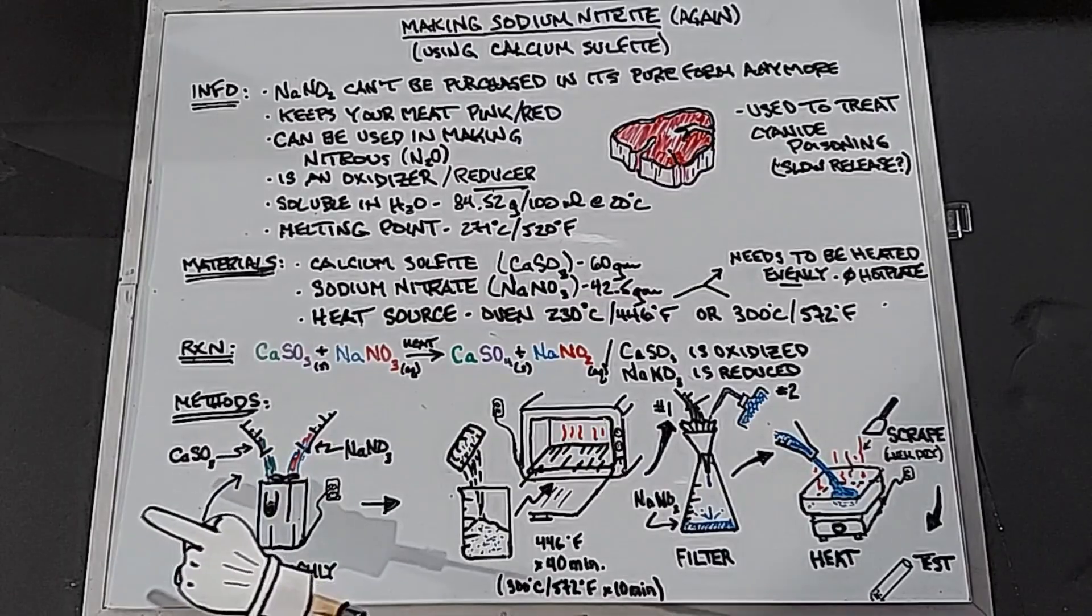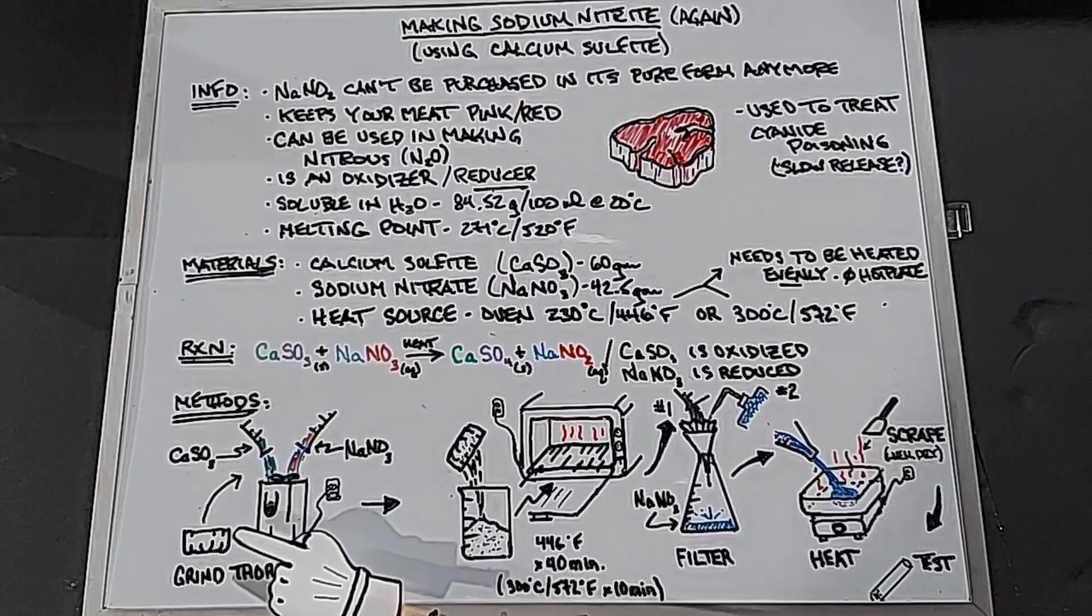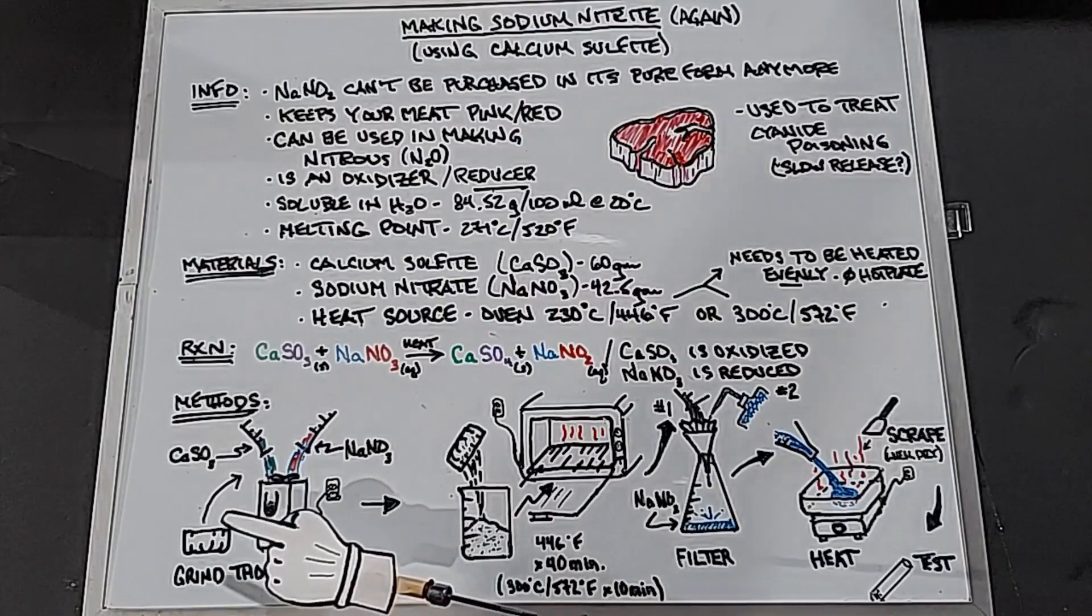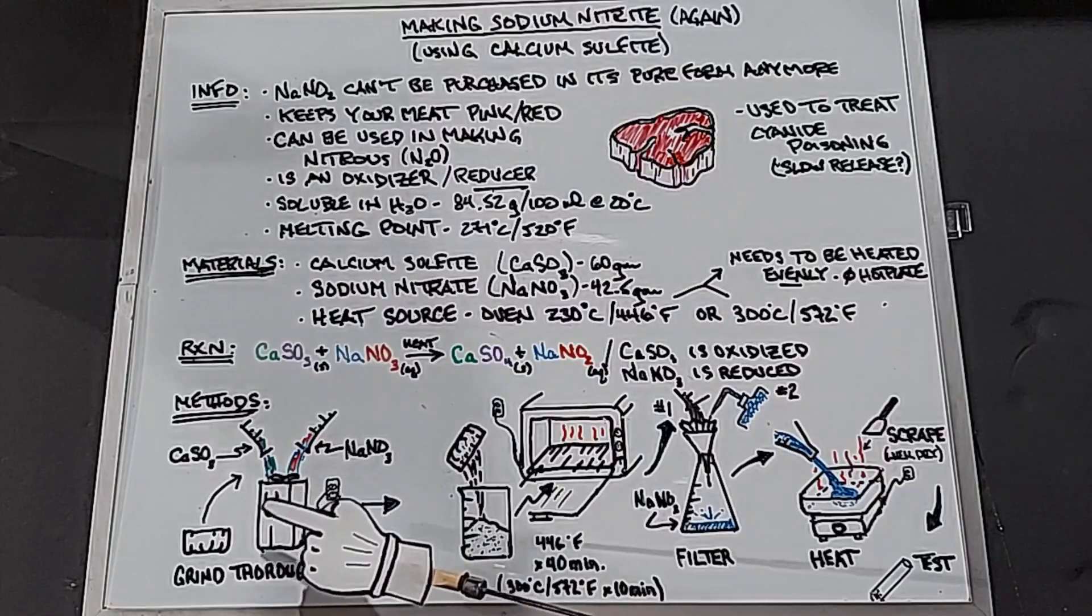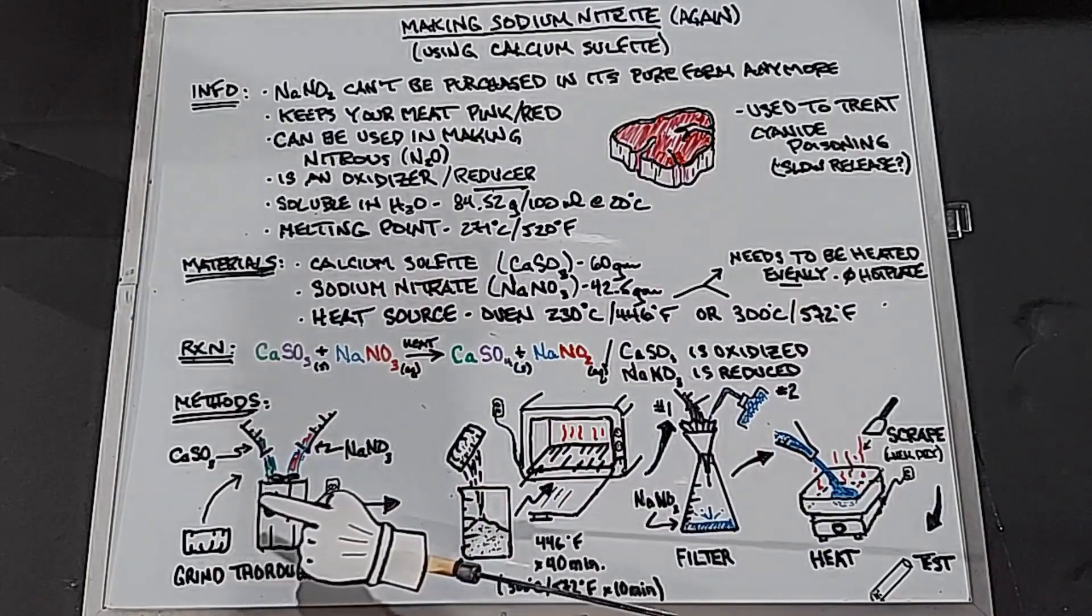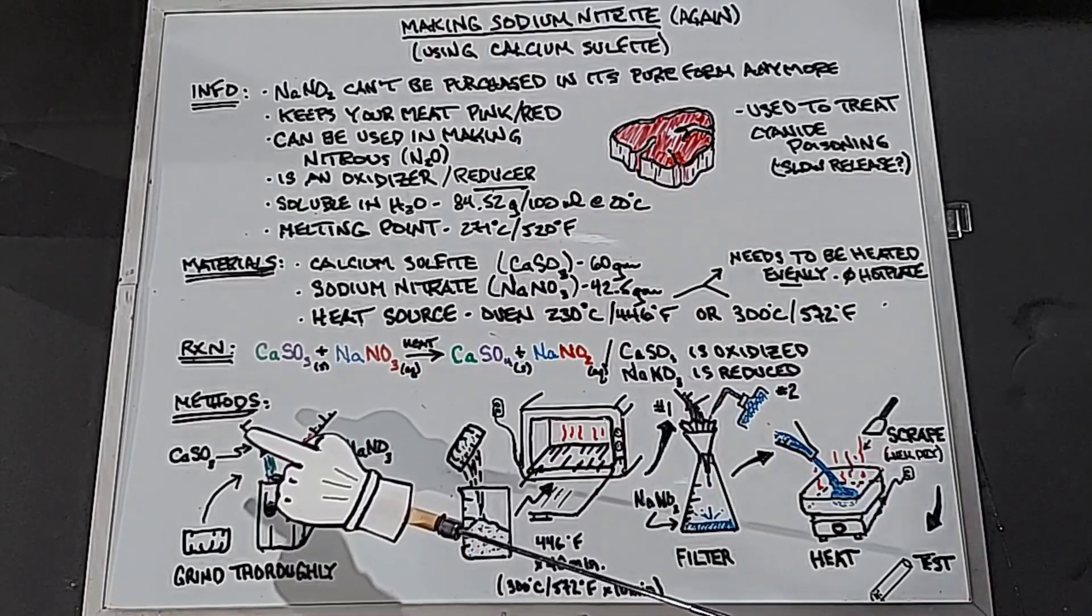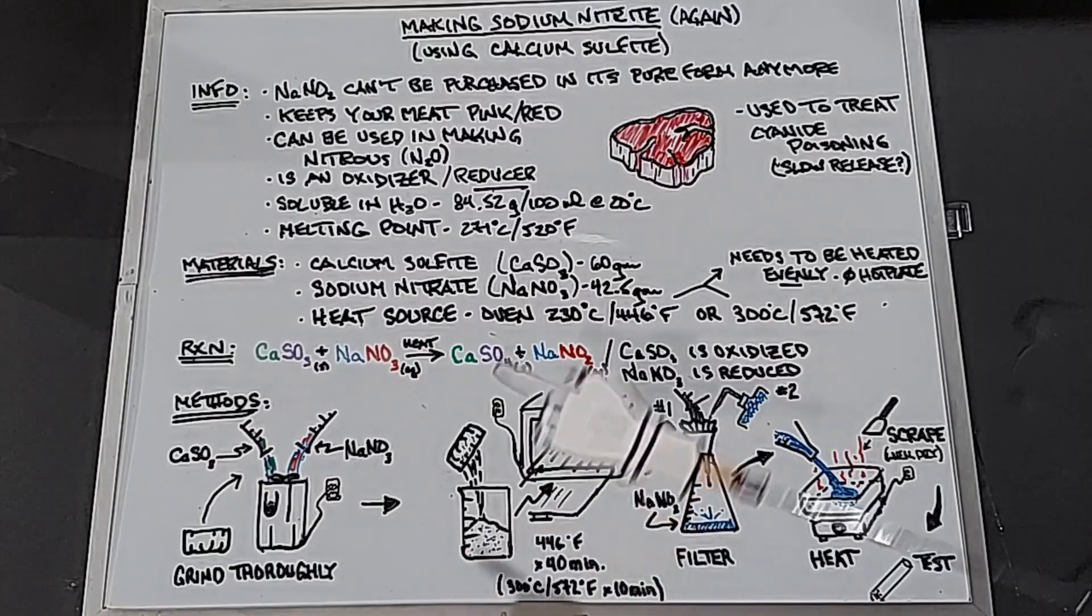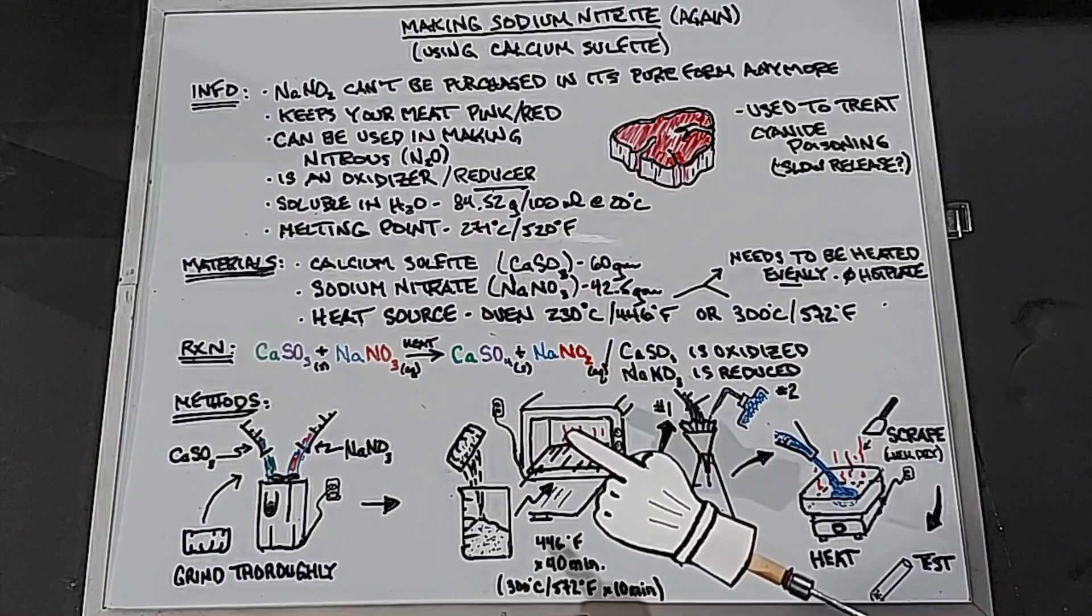In our methods, we're going to put the calcium sulfite and the sodium nitrate into a grinder. This is going to be a coffee grinder I'm using. Grind them really thoroughly and really well. Because there's not going to be any liquids used, these will only react if they're in close proximity to one another while the heat's being applied. So not only do you want fine products here once you grind them up, but you want them to be really, really mixed well, which both happen when you use a coffee grinder. Once they're ground finely, we're going to take them and put them inside the beaker I was talking about earlier. And I'm going to put it inside of a toaster oven, because most of the time toaster ovens actually heat up slightly higher than a regular oven will.